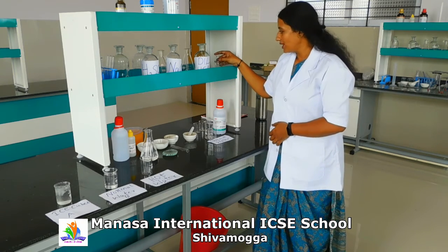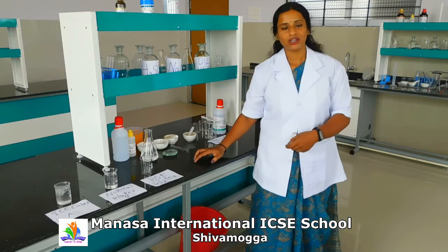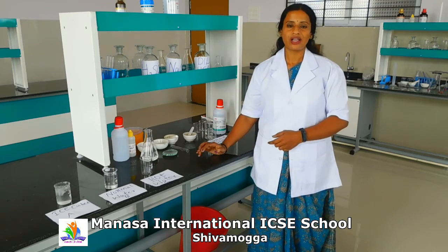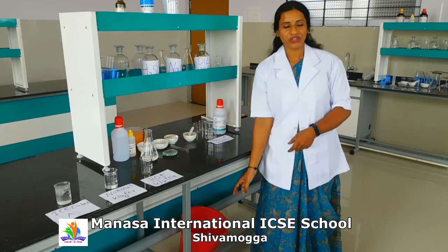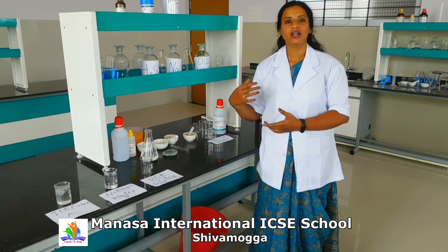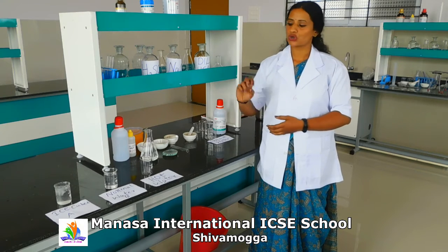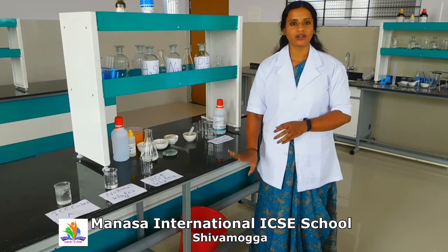So coming to general instructions for the chemical laboratory, each table is allotted to 2 students, and we also always have one dustbin. Whatever excess you have, like salts, filter papers or other materials you use, should not be dumped or spilled on the table. It has to be kept in the dustbin.